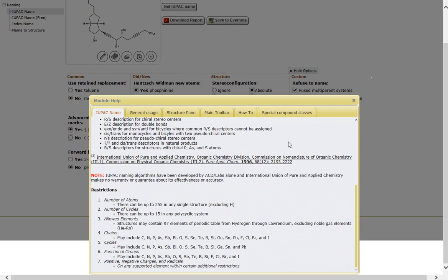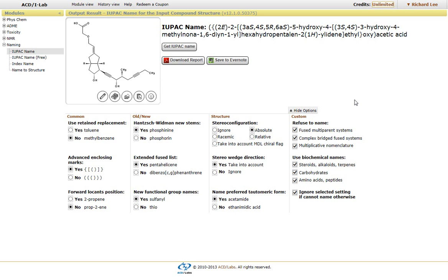This short video described how to use the ACD Labs iLab interface to generate IUPAC names, as well as the ability to generate structures from these names.